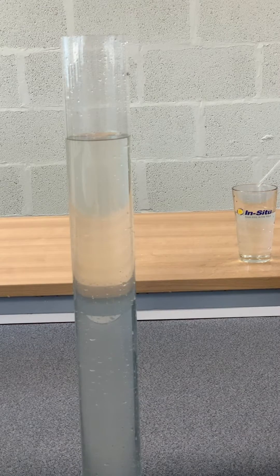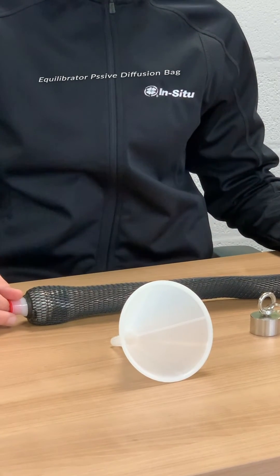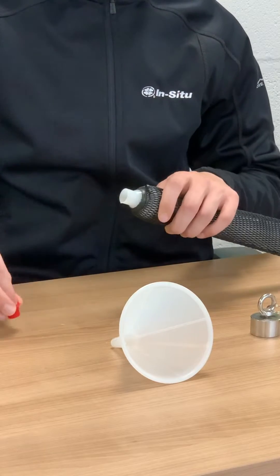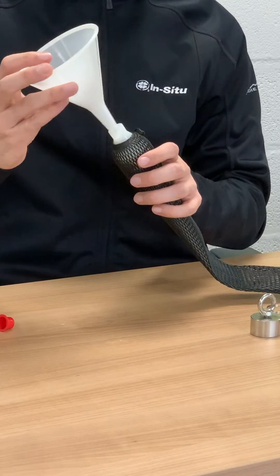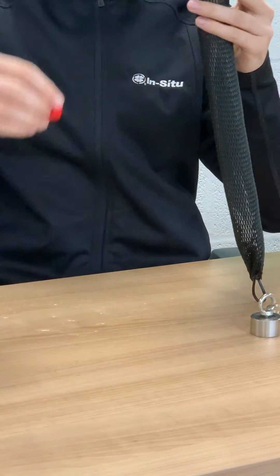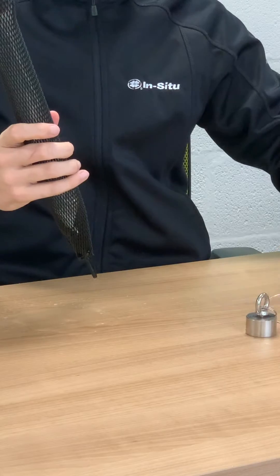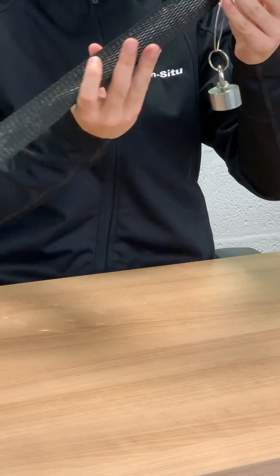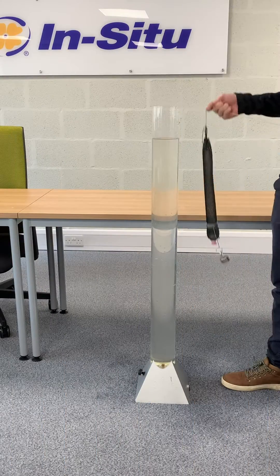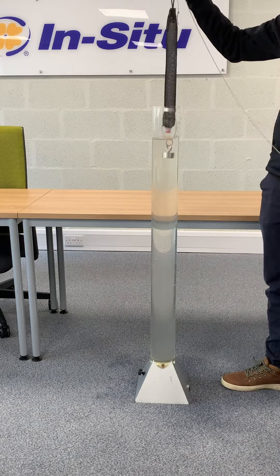Another type of no purge sampler is the passive diffusion bag. Here we'll demonstrate the Equilibrator. The polyethylene bag is filled with deionised water, which will be best to source from your lab to ensure that it doesn't contain any of the contaminants you are looking for. A weight is attached onto the bag for suspension. The device is lowered into the water column and left for two weeks to recalibrate.